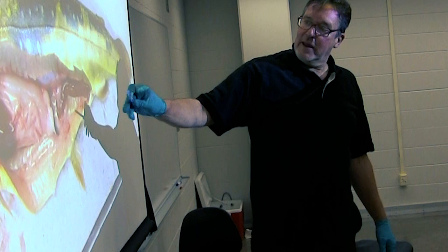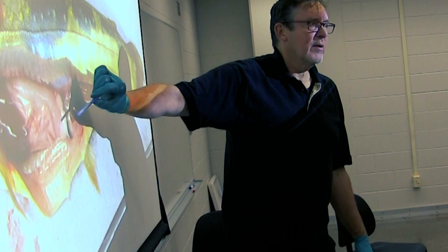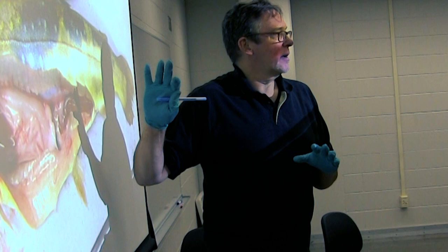There's a white mass here — that's fat. You're going to see fat, and as you probably know, instead of like a lot of our animals which put down fat within the muscle, a greater proportion in fish is going to be put down in the coelomic cavity. So this gives us an idea of the plane of nutrition.